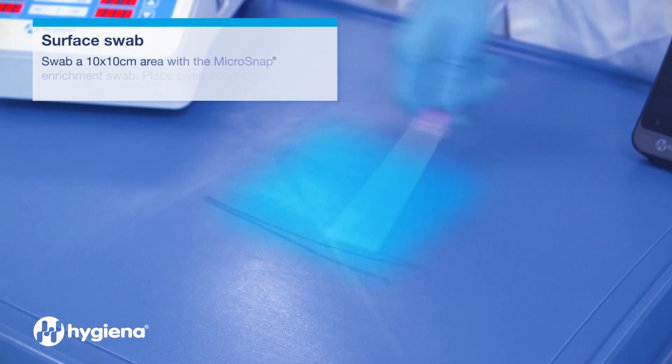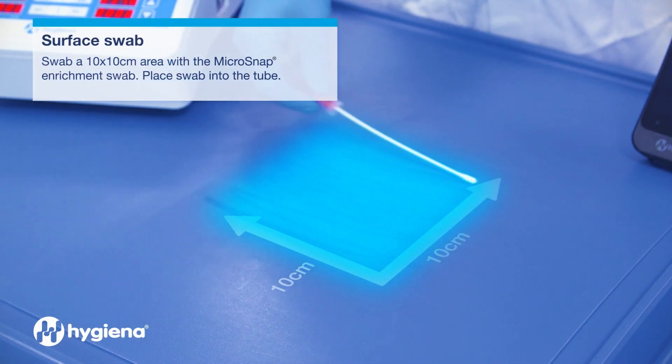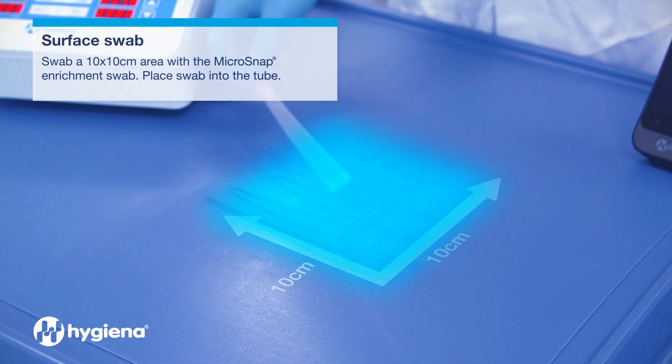Sample Collection. For surfaces, swab a 10 by 10 centimeter area using the pre-moistened enrichment device.